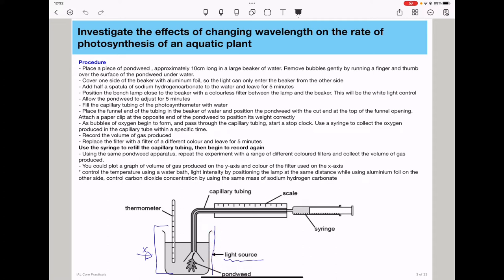In this situation, we are using a colorless filter because this is going to be our control experiment. So I say here this will be a white light control. After doing that, you will allow the pondweed to adjust for about 5 minutes, and then you fill the capillary tubing of the photosynthometer with water.